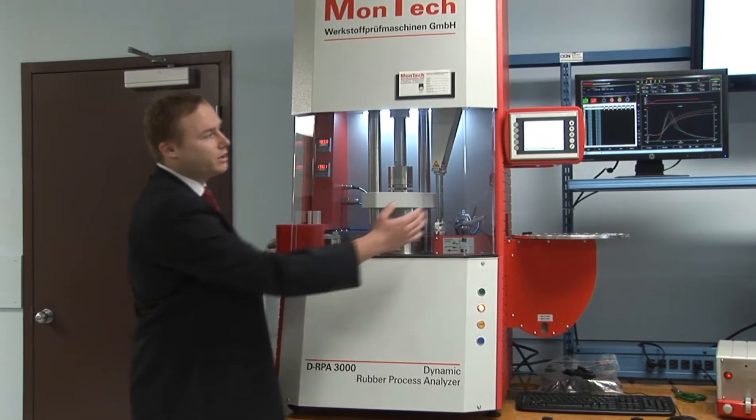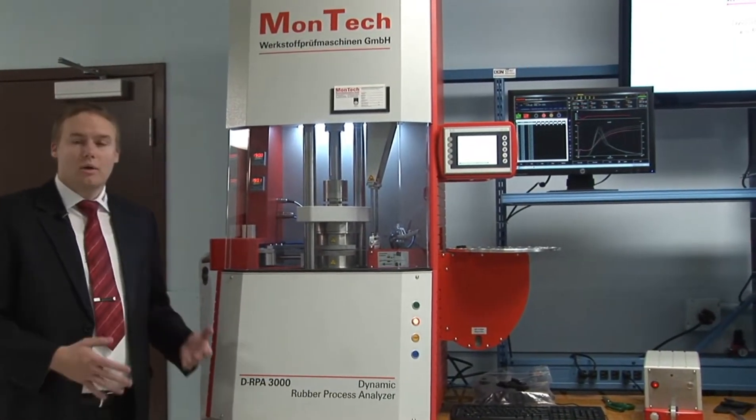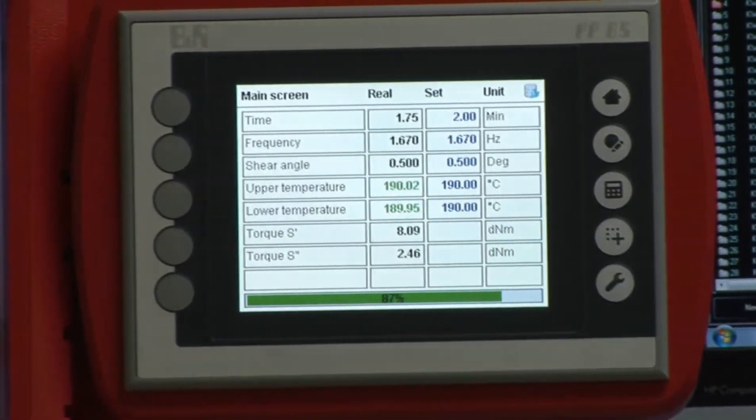This instrument is furthermore fitted with an instrument control panel. You can use the instrument not only in the lab but also directly in a shop floor environment, and therefore you don't need to set up the computer nearby the instrument.